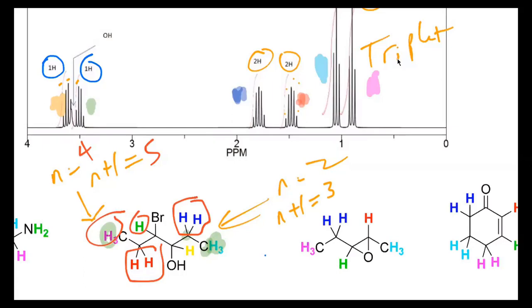So are you understanding now how to interpret the spectra based on the structure? If we had more time, we could take the infrared and the mass spec and the NMR together and build the structure based on what's in the NMR.